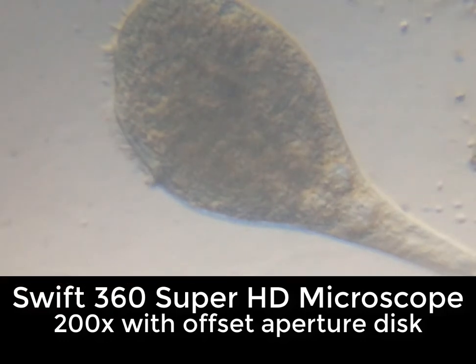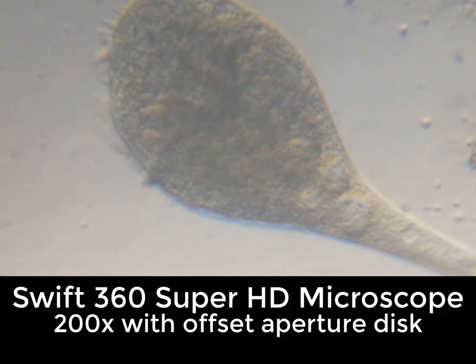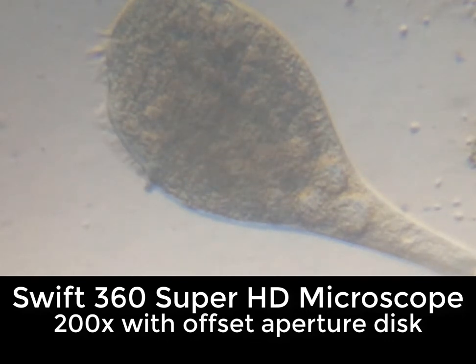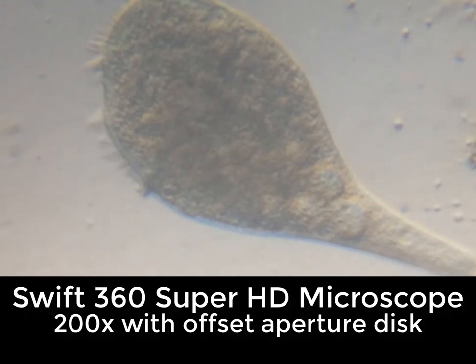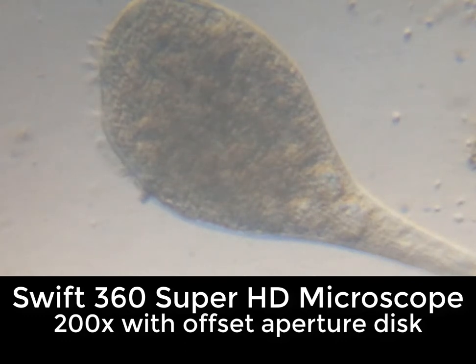Having said all this, there is one trick that really makes 200 power work, and that's moving the aperture disk slightly with live specimens — and you get this wonderful contrast. That's not bad for an inexpensive microscope.